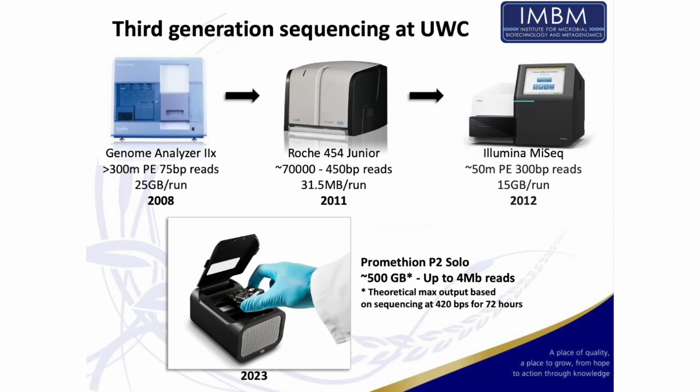The reads were exceptionally short. They were only 75 base pairs long. And you can imagine, if you think back to Rob's talk, if I'm trying to reassemble this genome from 75 base pair fragments, it is quite computationally challenging. So fast forward to 2011, and we saw this at a conference at the Lord Charles Hotel in Somerset West, and the eyes went like this. It's like, wow, this is cool. And so Marla and the then director were successful in securing funding to buy one of these for the lab.